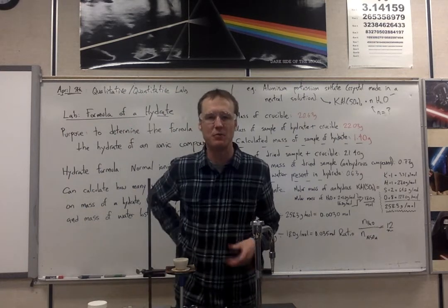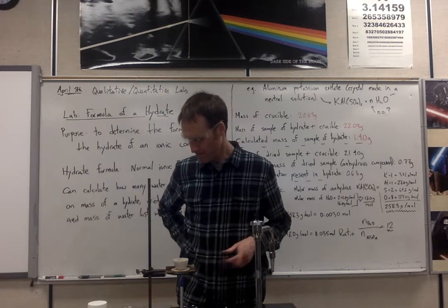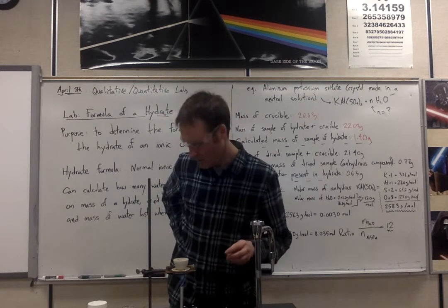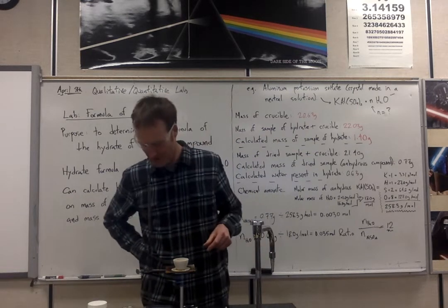At this point, you might even want to click forward something like 6 or 8 minutes. Or just a few minutes while I wait for this to dry out. I've run out of stuff to say.